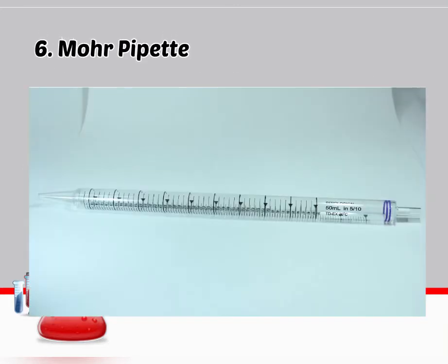Next, we have a Mohr pipette. A Mohr pipette is a graduated pipette that is designed to deliver small portions of a liquid or solution. These portions are determined by recording the difference between the initial and the final volume readings.